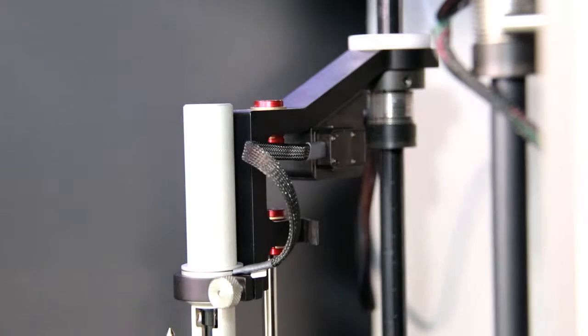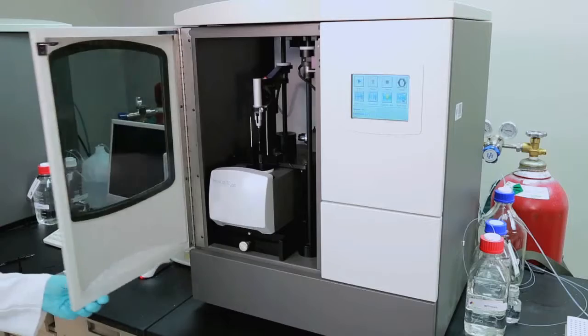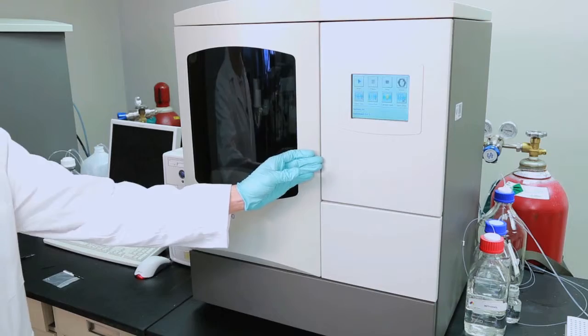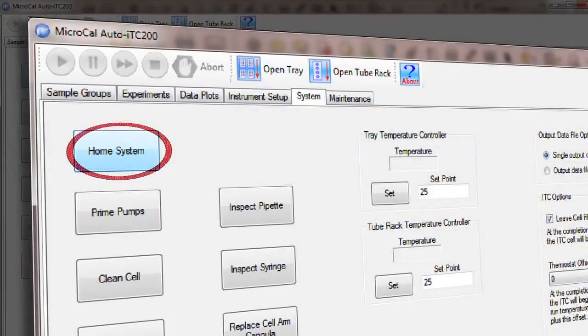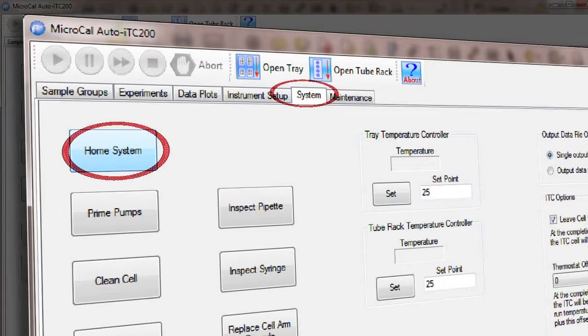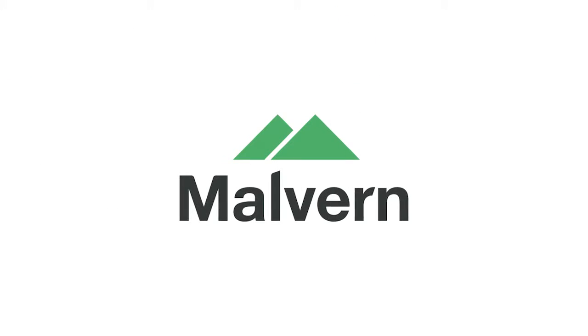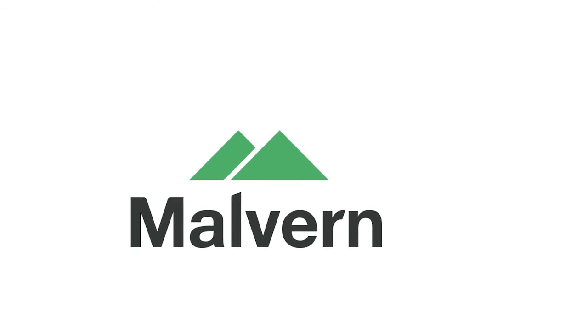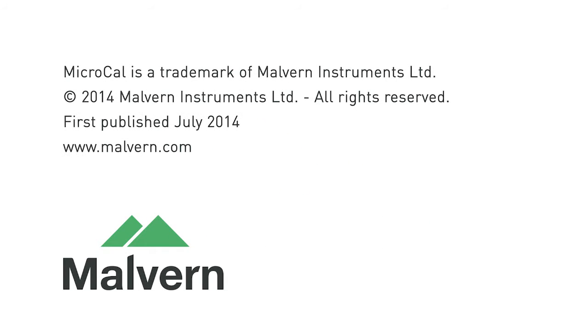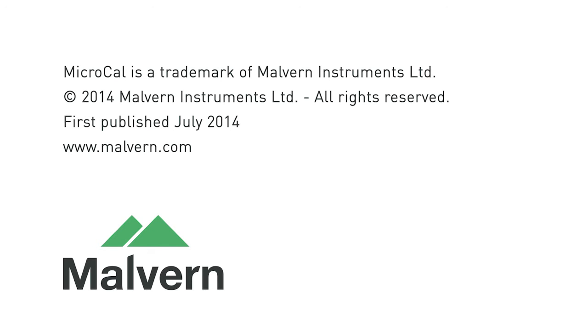As with any maintenance operation, the last step should be to close the door and home the instrument from the system tab of the Auto ITC 200 software.